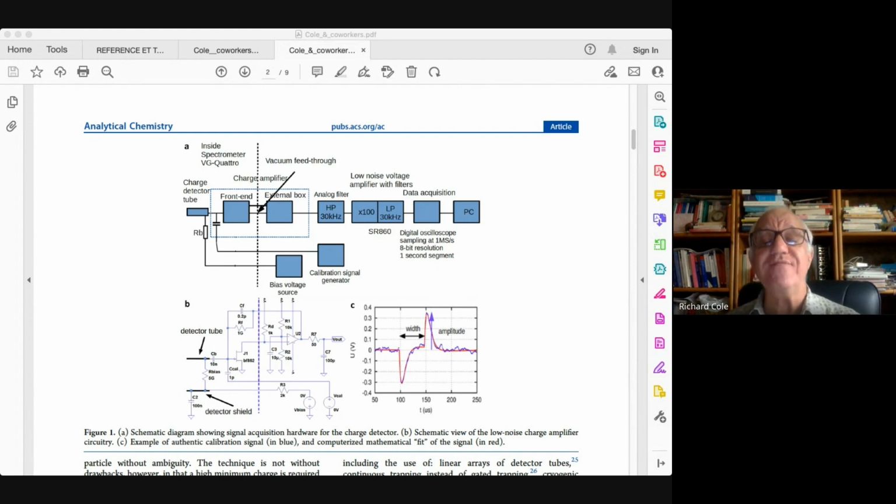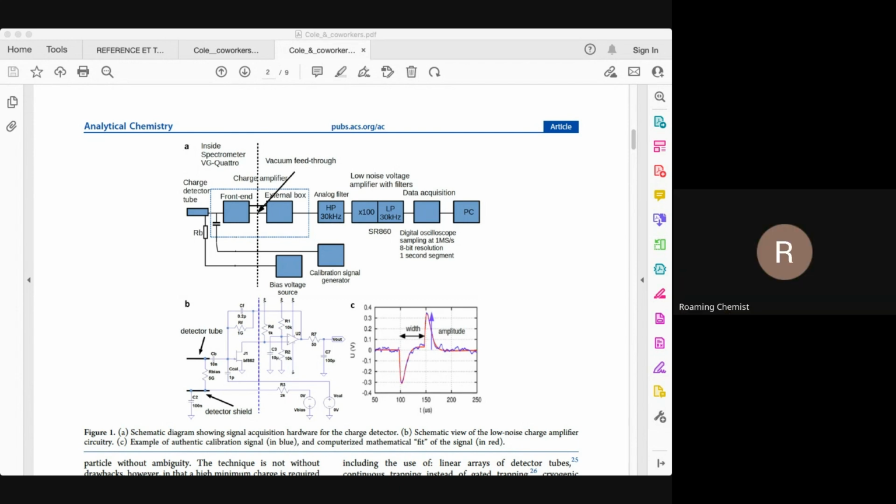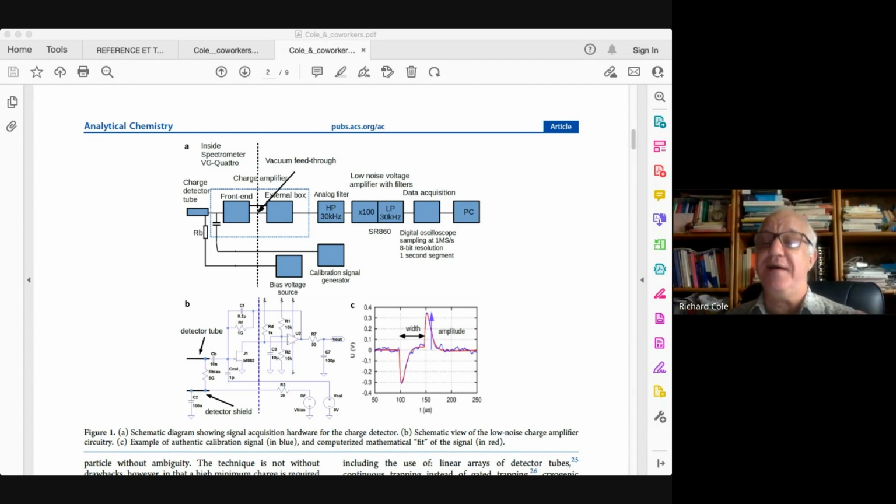It's only when you have a clean input and exit signal that a data point is registered. You're absolutely right that you could have multiple events occurring, but the data system is going to reject that.